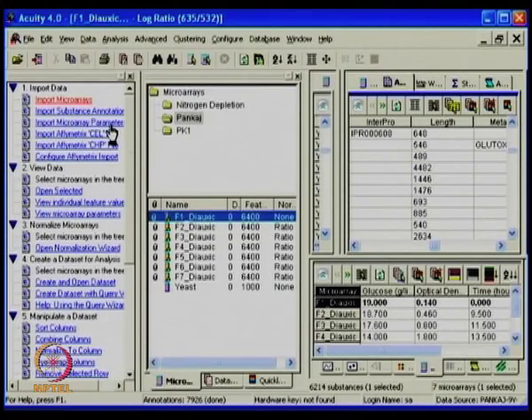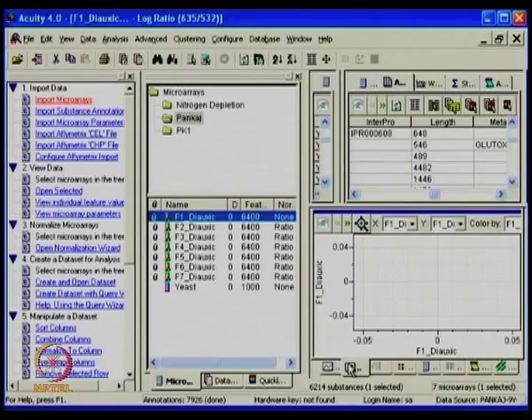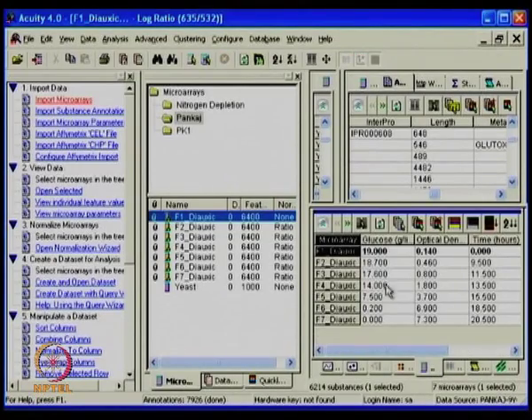Another very important thing is the parameter file. As you have said already, it is very, very important for a scientist to look at all the parameters and group accordingly. This can be made again in text delimited form and renamed to .mdt file, and this can again be imported so that all the parameters are visible in the window down here to look at. In a few seconds you will understand what each window means, but as it is, you can just switch over to different types, go to a parameter file and look at what details I have.